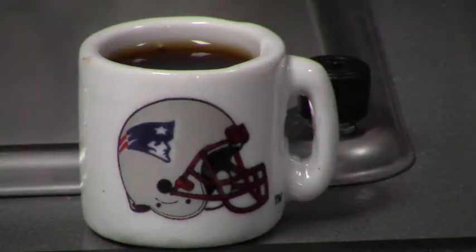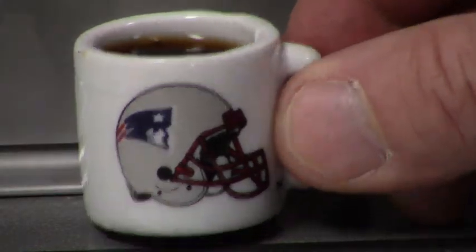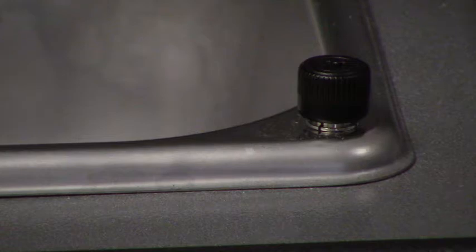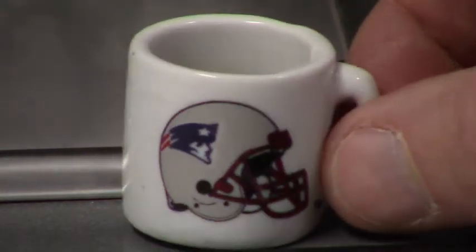Do you have big hands? Well, I do too. Mine are absolutely massive. Oh, that's hot. No matter how big the problem is, the HIAC-811 Plus is the instrument that can help you solve it.